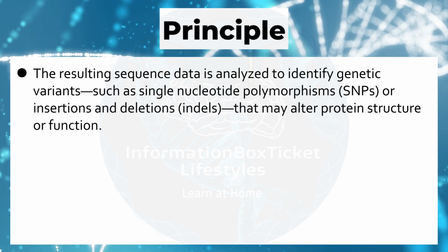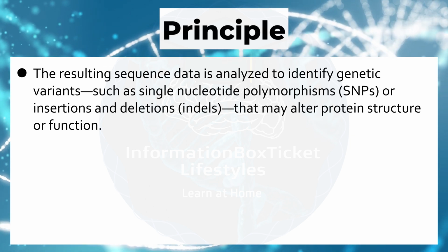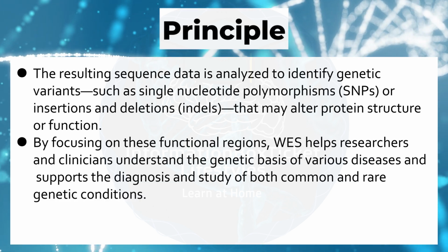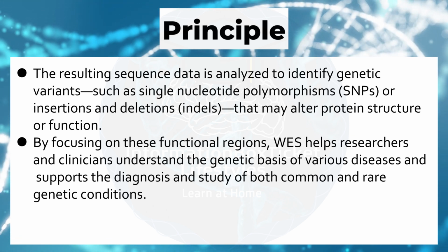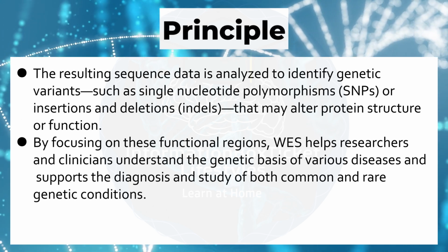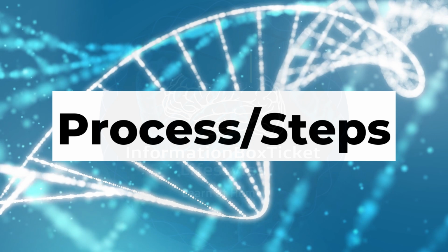The resulting sequence data is analyzed to identify genetic variants, such as single nucleotide polymorphisms or insertions and deletions, indels, that may alter protein structure or function. By focusing on these functional regions, whole exome sequencing helps researchers and clinicians understand the genetic basis of various diseases and supports the diagnosis and study of both common and rare genetic conditions.